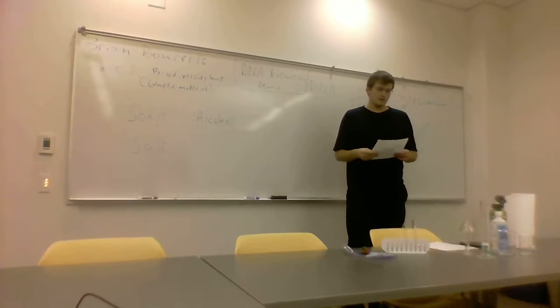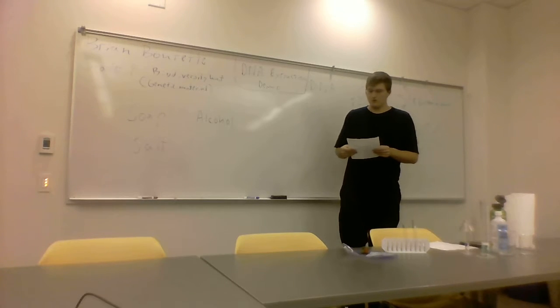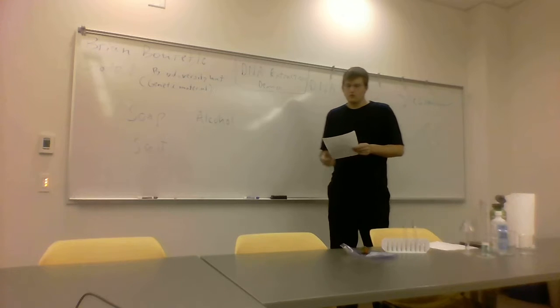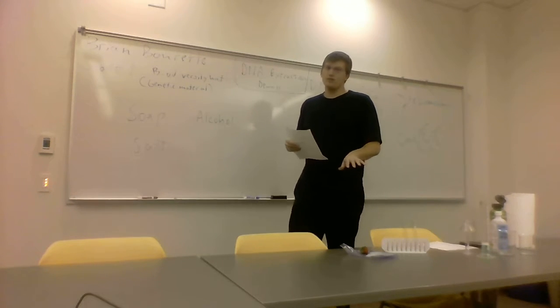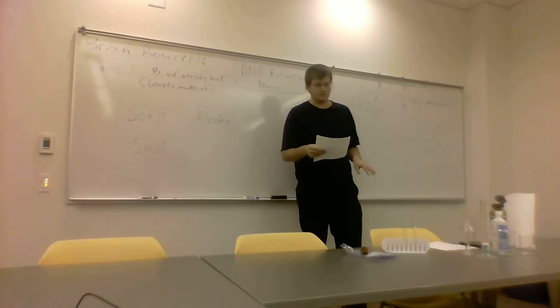So today we're going to be going over genetic material, also known as DNA. Before I get jumping into our little lab demo, I'm going to go over a couple of key concepts before we get into this.